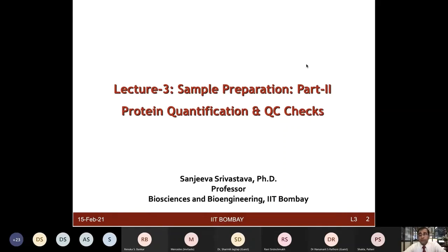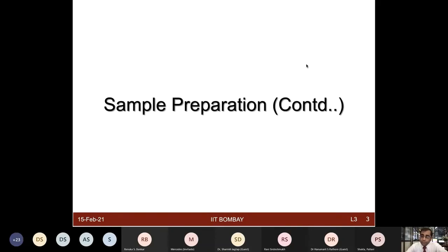Whenever you are starting your project, it's a good idea to start in a very unbiased way. Even if you are very knowledgeable in your project, you should still think about what is known in the literature, read about it, look at what kinds of methods people have used, and see how best we can learn from those methodologies and protocols.